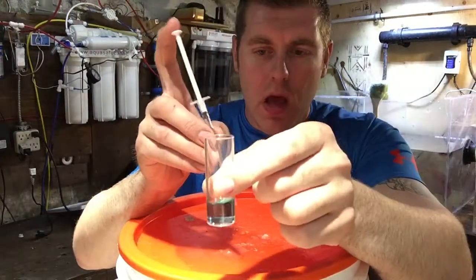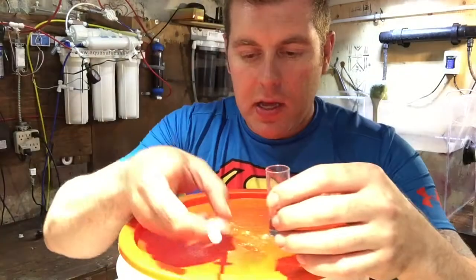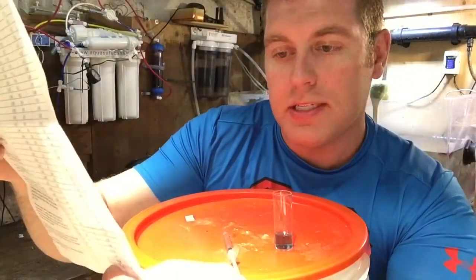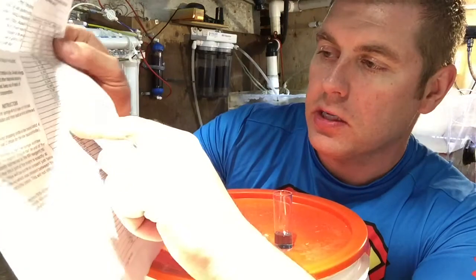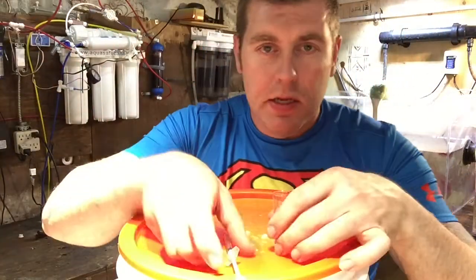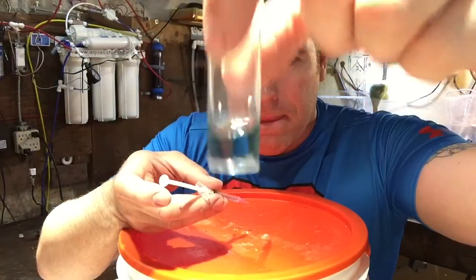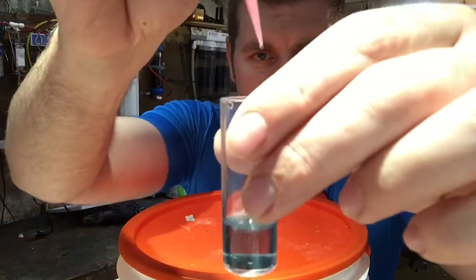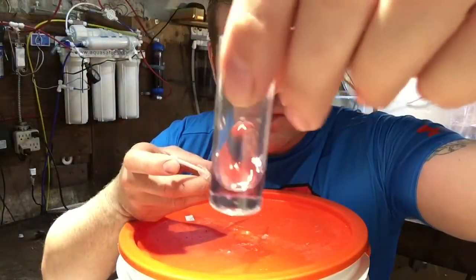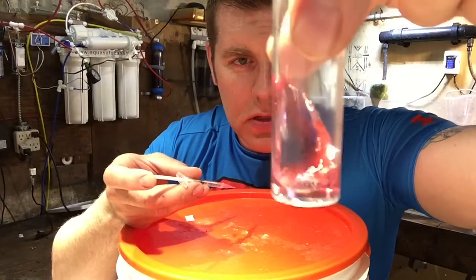Now we're going to add a few drops at a time from the syringe into the vial, shaking it after each addition, until the solution starts to turn from bluish-green to a pink or orange color — that's what we're looking for. Here are the instructions that come with the kit; it has all your readings on the side. Natural seawater has a KH of seven to eight dKH. Keep adding drops until it turns pink to orange — there it goes, pink to orange.